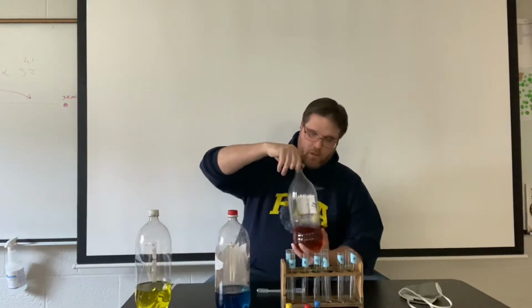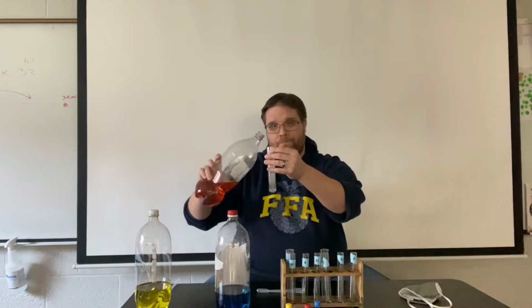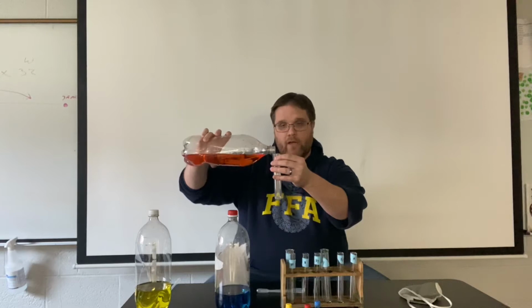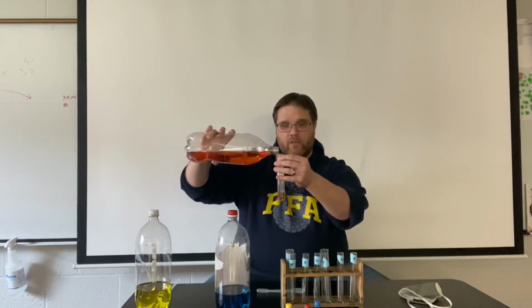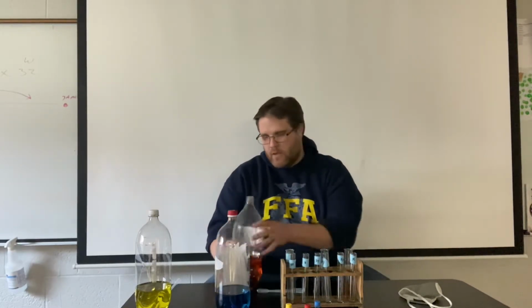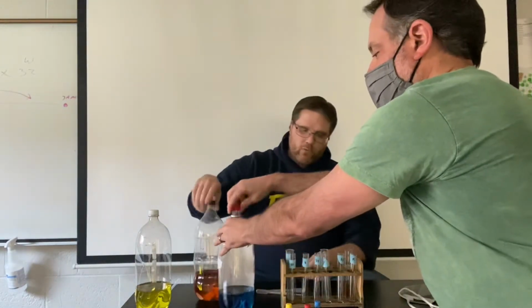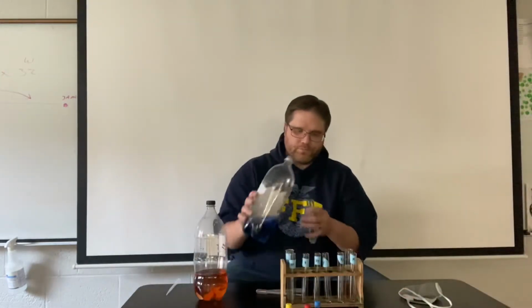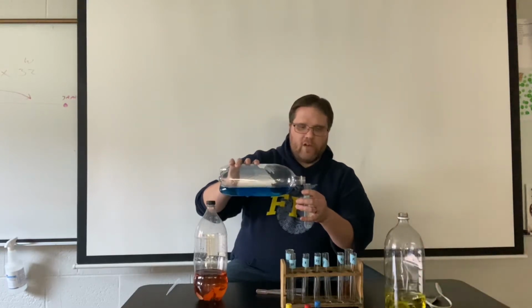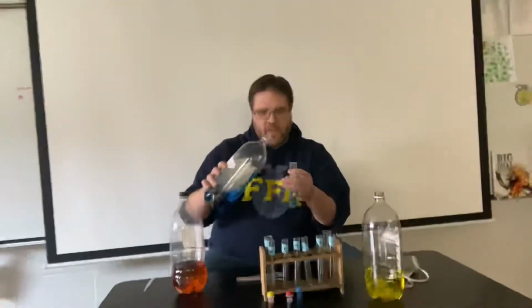Okay, so the first one that we're going to do is I'm just going to pour the red into our larger test tube here. As we do this, you want to be very careful as how you actually pour it, because you don't want to spill a lot. So you're just going to pour a little bit in there, fill it up maybe halfway, maybe a little under halfway. And you're going to do this with the 3 larger test tubes. So we'll start with the next one, which is our blue. And again, all of the test tubes that are here are labeled with the correct colors, what you need to add and mix. So you just need to follow the instructions on the test tubes and in your lab.